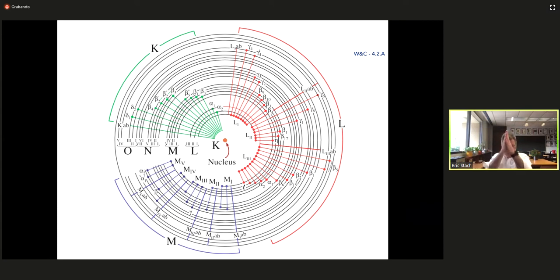Now, that's for standard modes. If you're doing the highest resolution in STEM, you generally use a different microscope that's got a probe corrector. As I was just showing you at the CFN, there's the 2100F, the Talos. Those are not probe corrected. So their resolution's around 2 angstrom-ish, 1.8, 1.6, depending on the instrument and how good you are. But if you want to go to sub-angstrom, you need an aberration corrector. And generally, those aberration-corrected instruments just operate in the one mode, right? The high-angle annular dark field STEM detector, that's all it does. But it also, of course, does the EDS and the EELS on top of it.